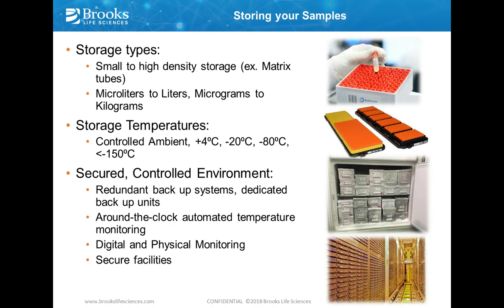And then looking at your storage format is also important. In the upper right-hand corner, you see a picture of a standard cryo vial. And even in this picture, if you have very good eyesight, you could see that what happens with most standard cryo vials is only a portion of them gets filled. Storing in standard cryo vials, while traditionally that works incredibly well, from a storage density standpoint, they actually do take up a lot more space. And so planning your storage in a way that you can maximize the footprint will help save storage costs for you in the long run.